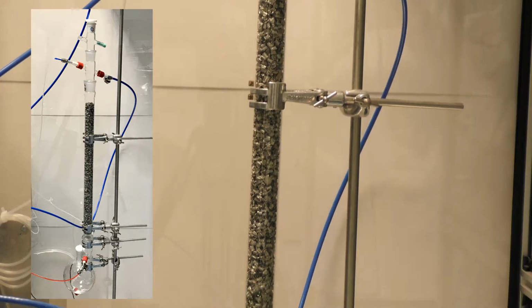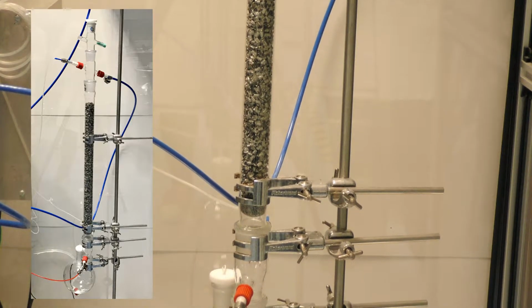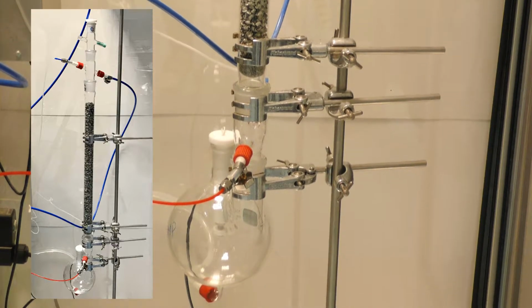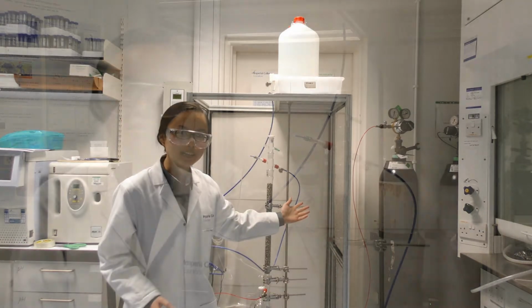The entire glassware has a modular setup with various interchangeable parts. Before each experiment, one needs to think about what parameter we want to measure and how we are going to measure it. Then connect the pieces together, just like in Lego toys. In this video, we will be performing hydraulic tests using DI water and nitrogen gas.